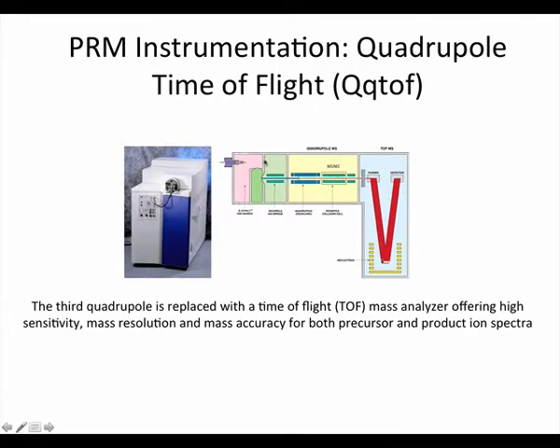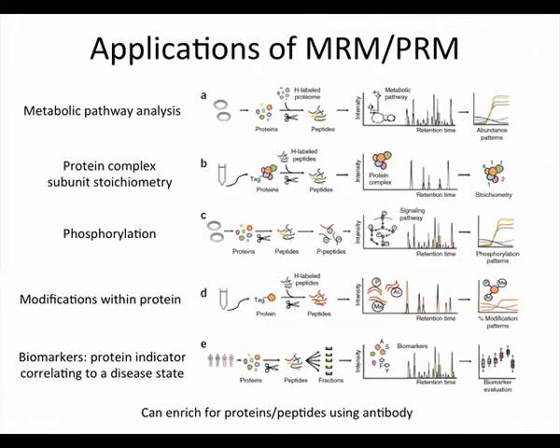And this is just, for those people who like to look at instruments, what that looks like. Instead, this last step here is actually a time of flight mass analyzer. So it's a lot more sensitive than the last readout in the MRM.